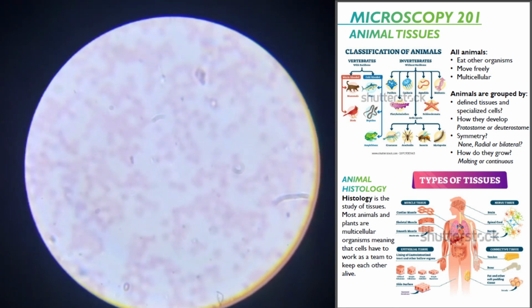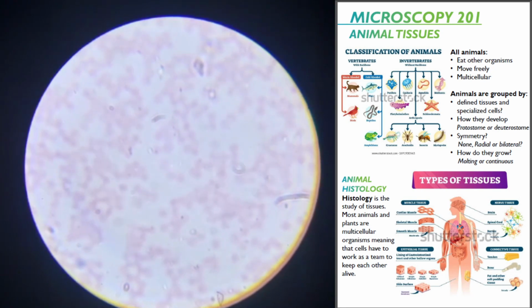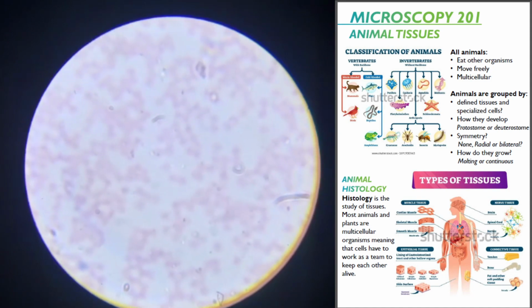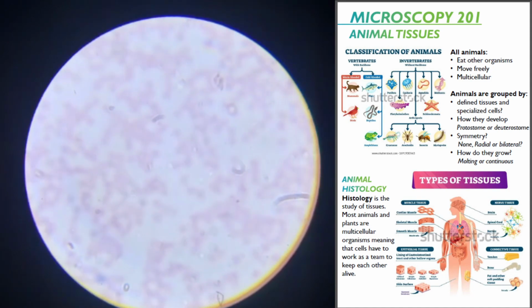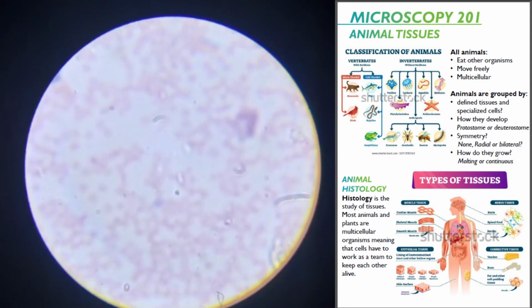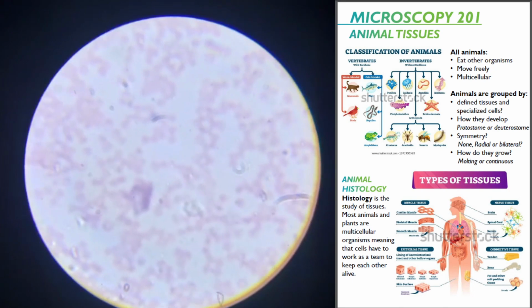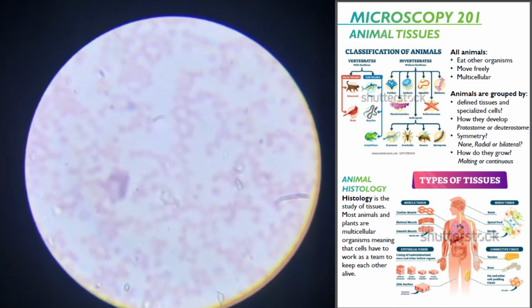I still have some stuff on my slide. See that purple cell at the top. I see one down here at the bottom. Whoa, there it was. There was the big one. Big old boy. Sorry.